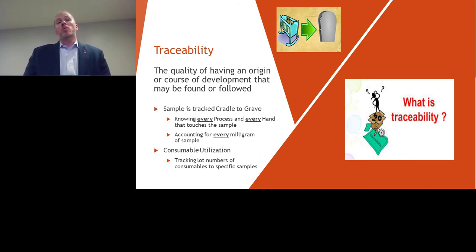And then also you want to be able to track what consumables you utilize, primarily because if something would happen and there's a recall on a consumable or something of that nature, and that consumable was used in your lab, you will be able to trace back what samples that particular consumable was associated with.